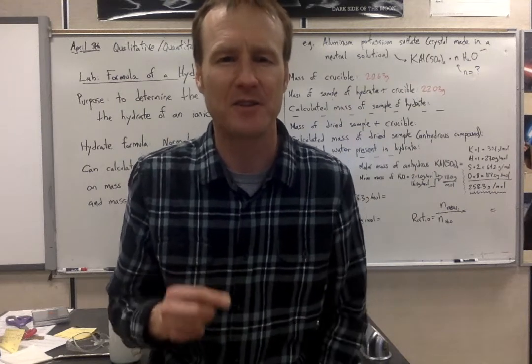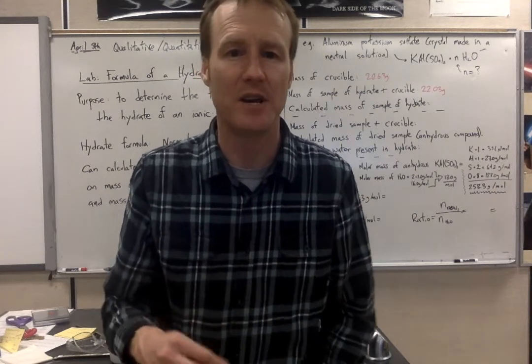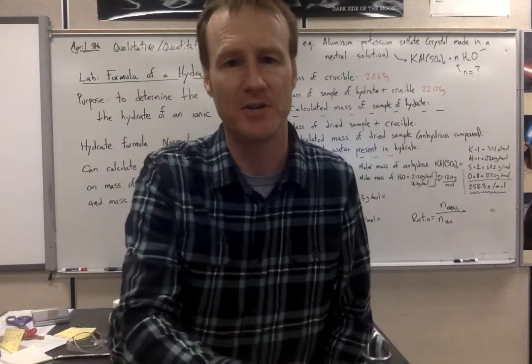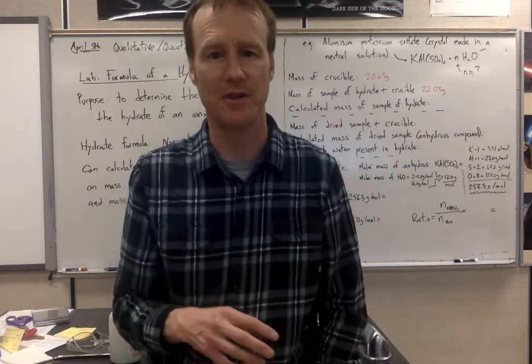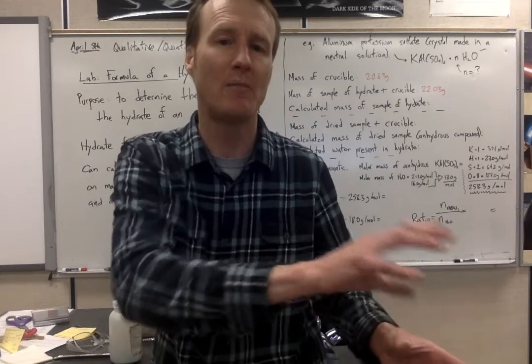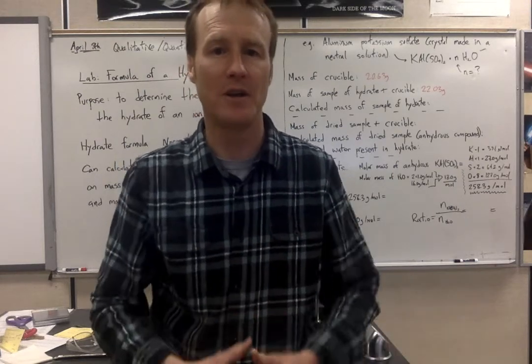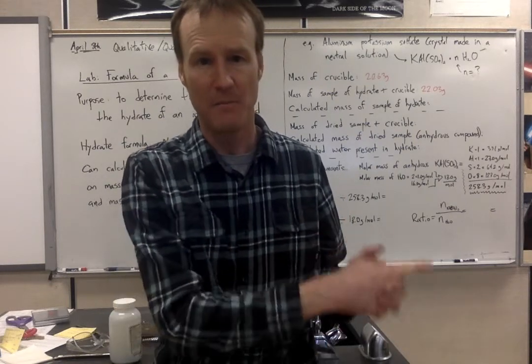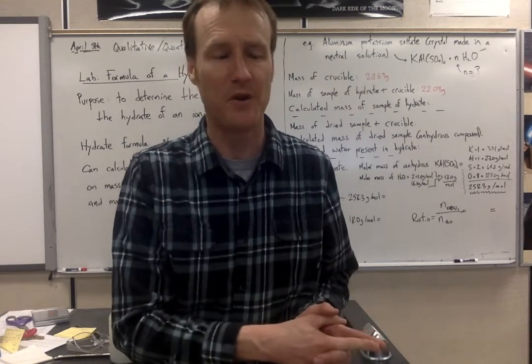The thing about these crystals is they're not dodecahydrate. A different number of water molecules associates with the crystals when they're formed in a neutral solution. And the question is, what is that number? How many water molecules associate with each formula unit of the aluminum potassium sulfate? Doing a lab, we're able to figure it out.